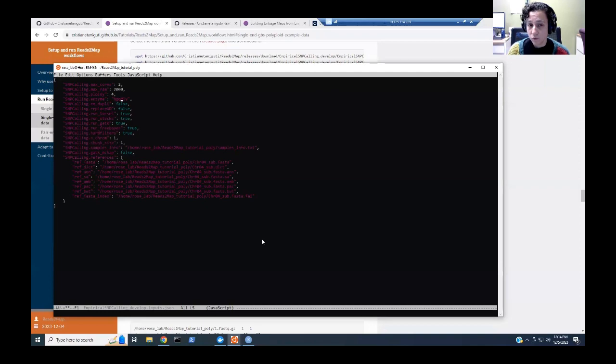The enzyme we use for the GBS, and whether I remove the duplicates, because in whole genome sequencing you should remove the duplicates, in GBS you shouldn't, so I put false. If I will replace the AD, this parameter is explained better in the paper, but every time the genotype is missing, I will replace the read counts by missing too. In this case, I would not do that.